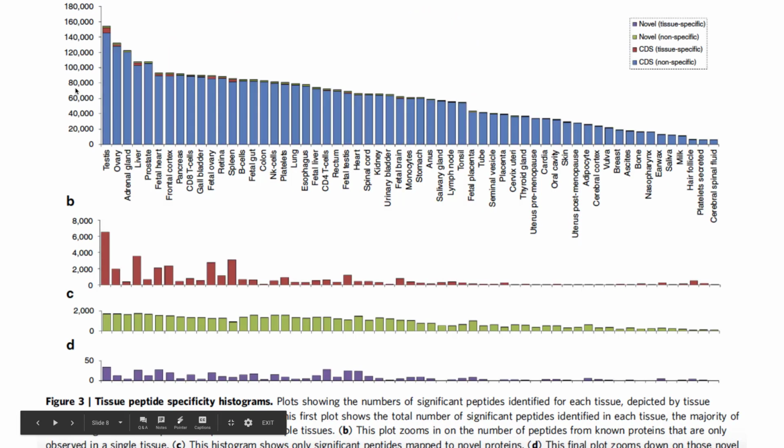All right, so that's the workflow. And all of you are going to be engaged with either those workflows or just the products of the workflows. We'll just think about the products of them. So again, we're talking about the scope of information that has to be managed in order to work with this stuff. This is a histogram giving how many distinct peptides are found in different human organs. So it goes up to about 160,000 per testis. And a lot of these tissue types of great interest, B cells, for example, have close to 100,000. T cells, just the CD8 type.